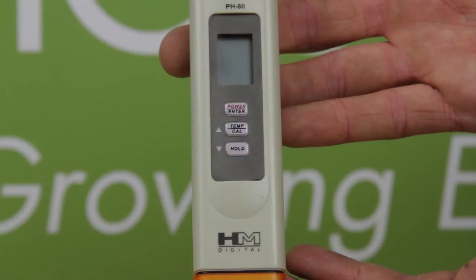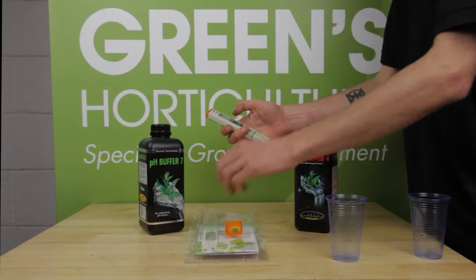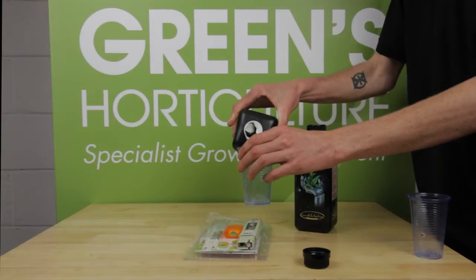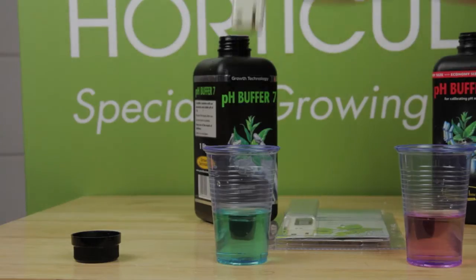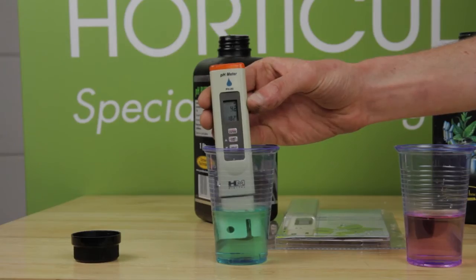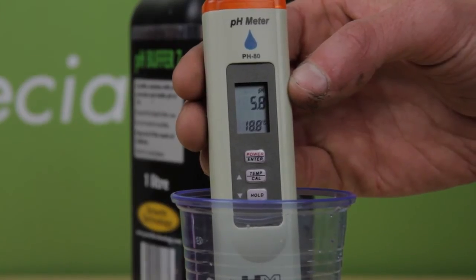The pen has three buttons, each clearly labeled. To begin calibration, remove the pen cap and switch it on. Then pour some buffer 7 into a cup and immerse the freshly revealed end of the pen in the buffer 7 solution. The pH is guaranteed to be 7, but as you can see we're getting a fluctuating reading that stabilizes at 5.8.